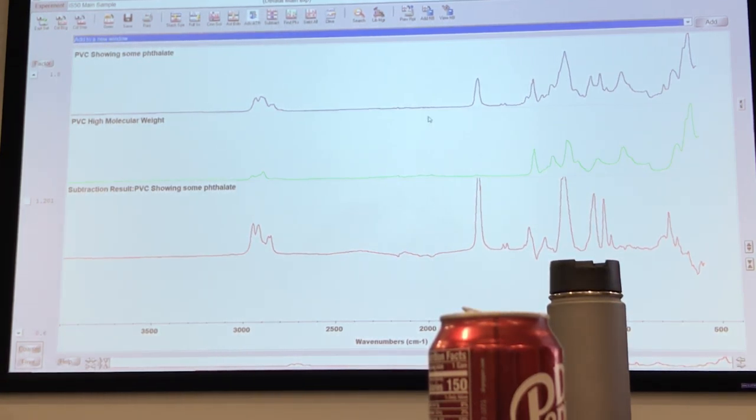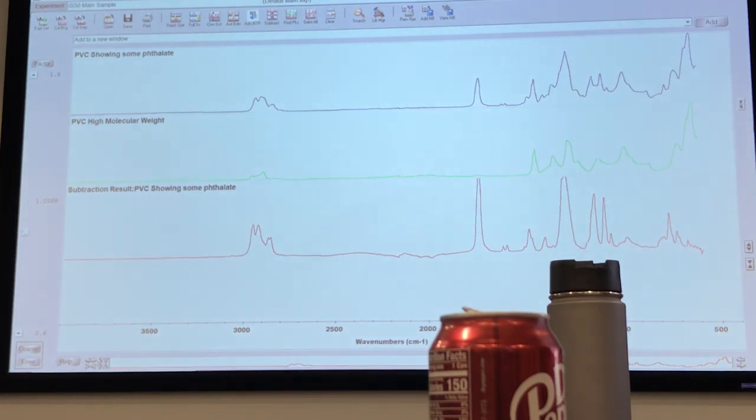When you do the subtraction, the bottom one is getting subtracted out from the top one. This is to set the factors. So here we can just play around and see which factor gives us more. Factoring out is kind of subtracting an equivalent amount from the main sample. Now I feel like I have gotten rid of most of the negative peaks, and I have mostly the peaks that should stand out on their own.